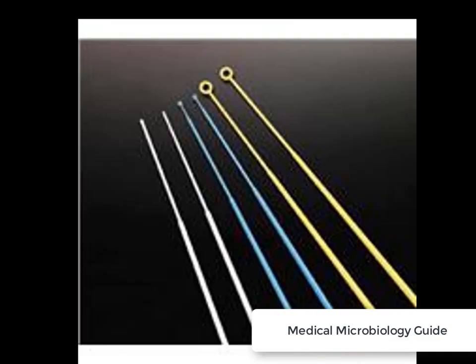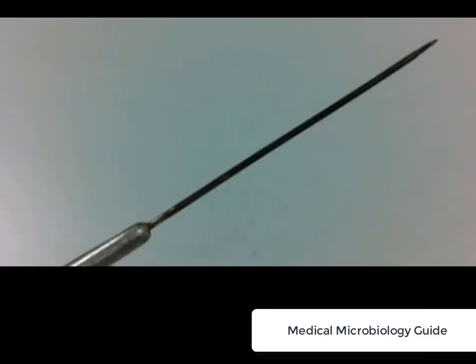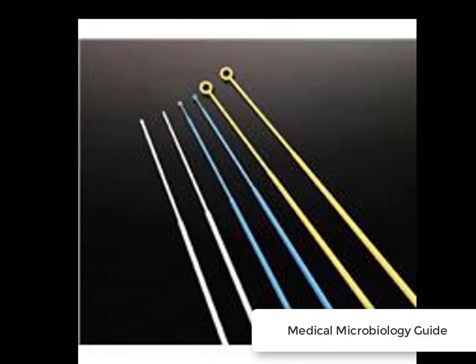It can be a disposable one or a reusable one. A reusable inoculating needle is made up of nichrome or platinum wire affixed to a metallic handle. The disposable needles are made up of plastic resins.